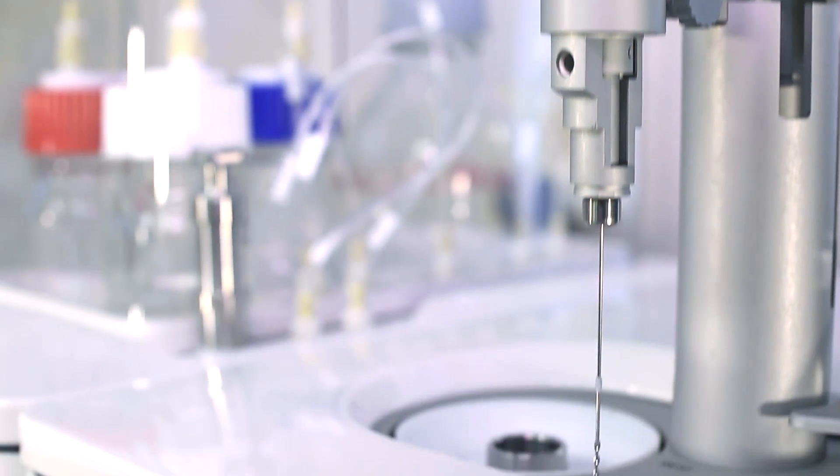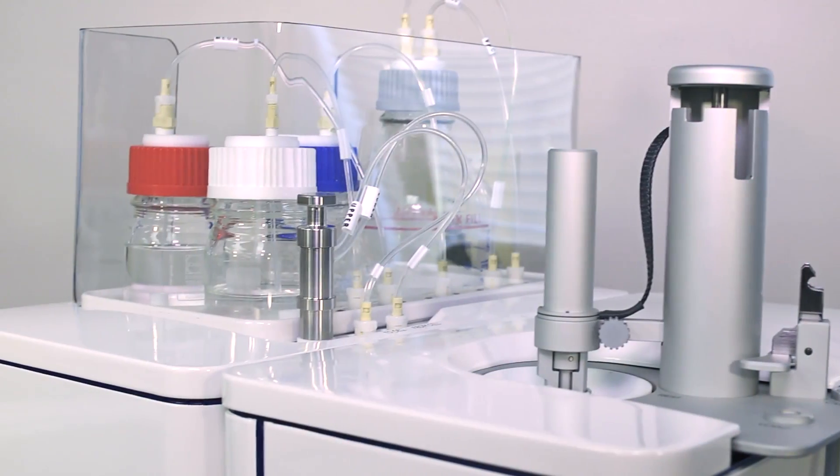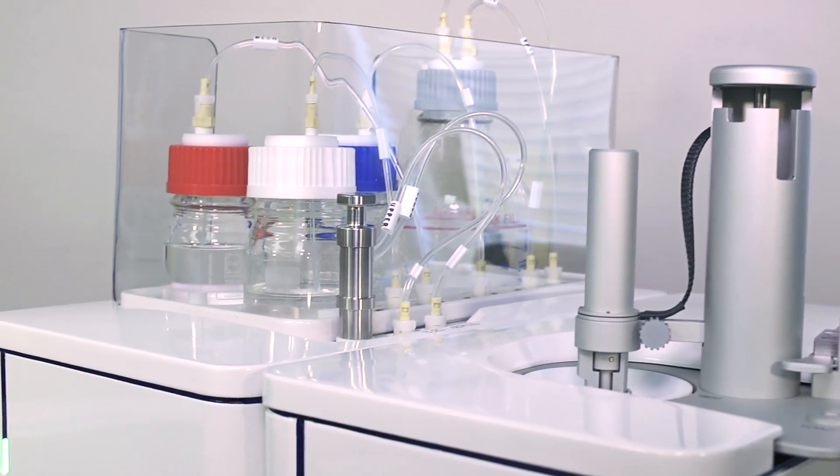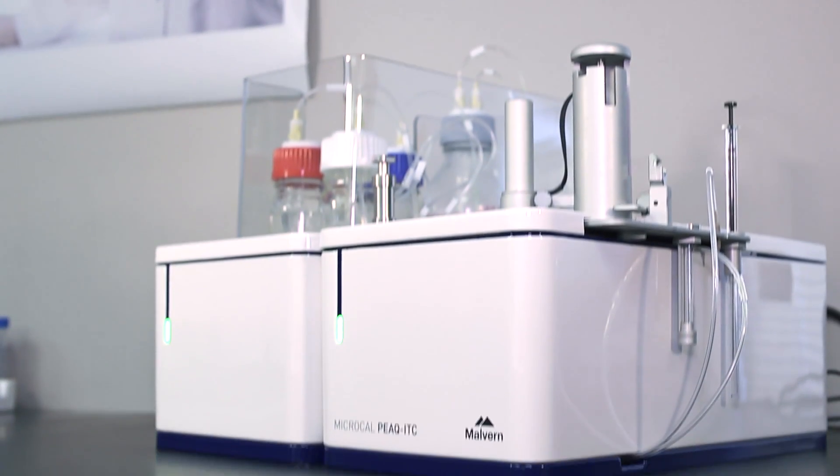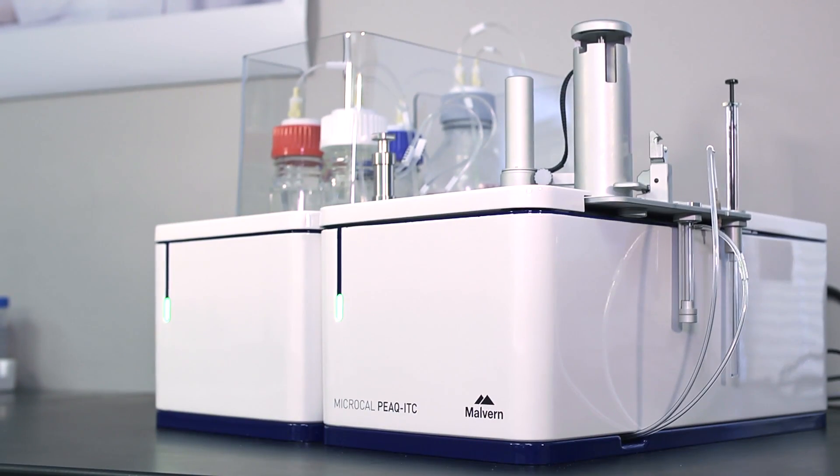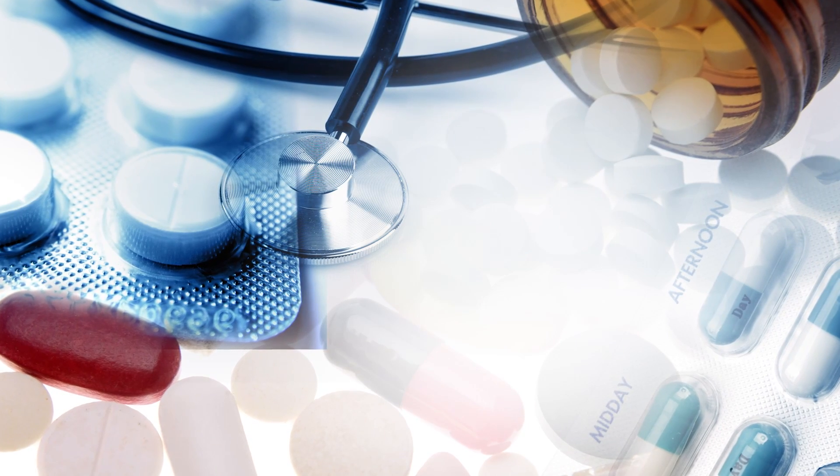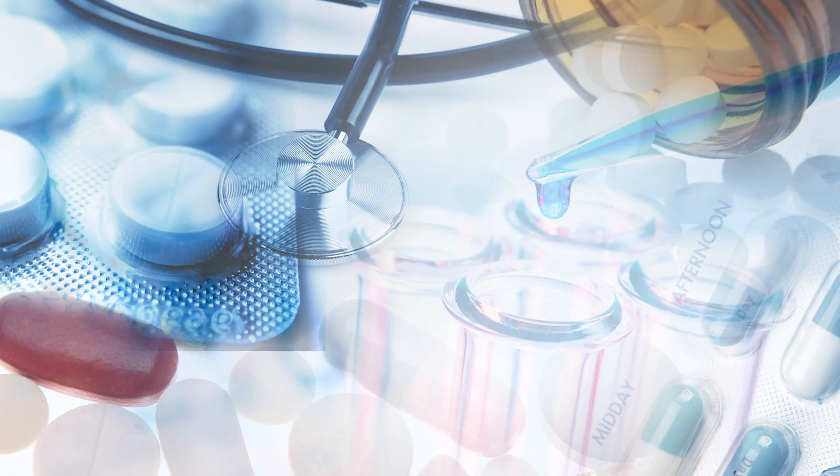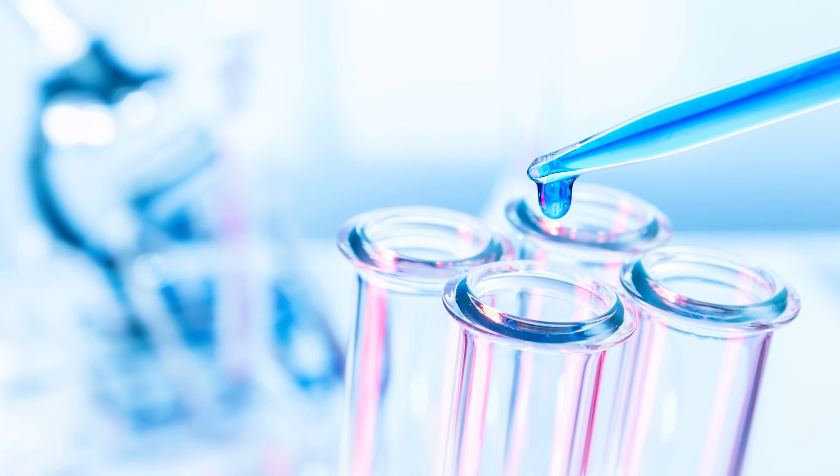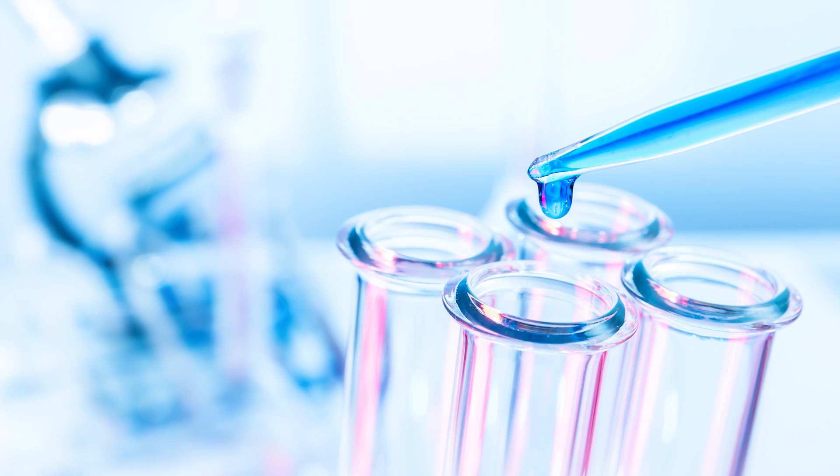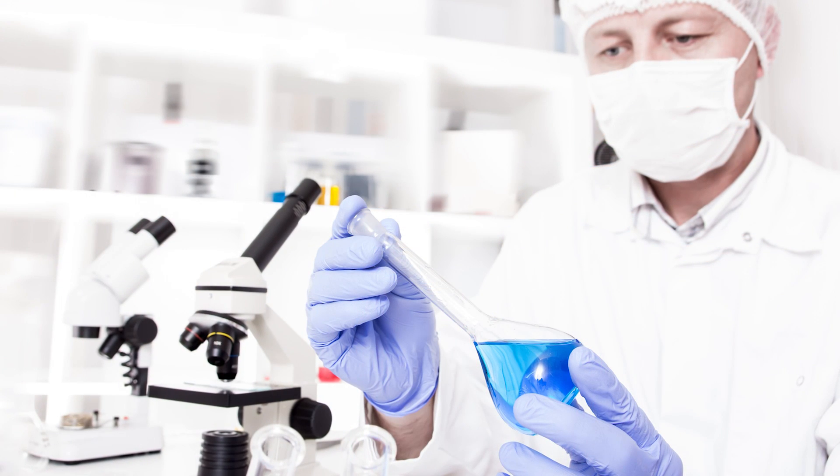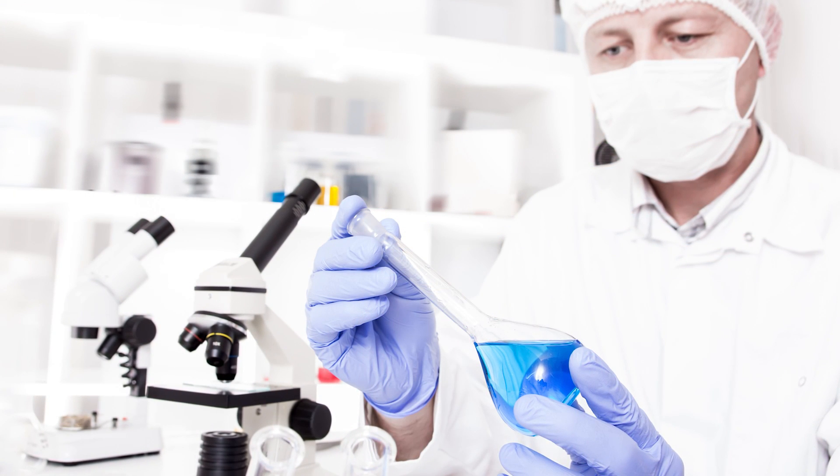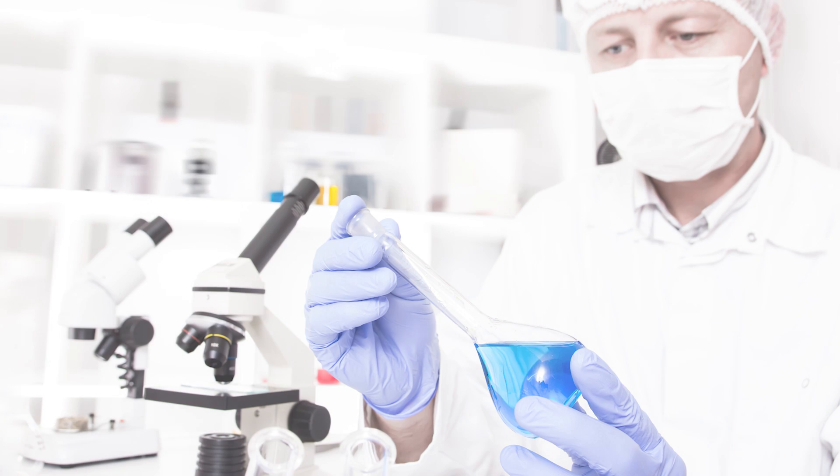The wide affinity range enables analysis of weak to high affinity binders with excellent reproducibility. Applications for the Peak ITC are predominantly within life sciences and drug discovery and is an essential tool for any research laboratory studying biomolecular interactions where high sensitivity and fast results are paramount.